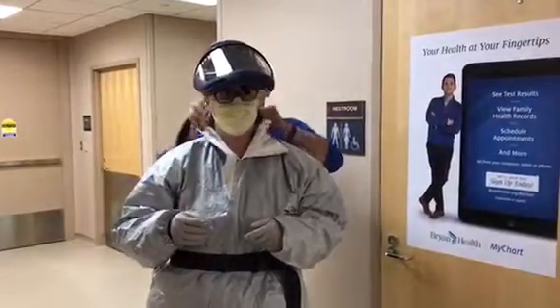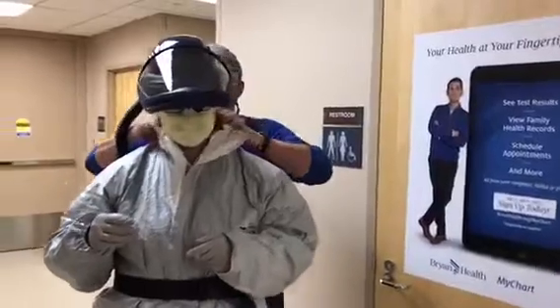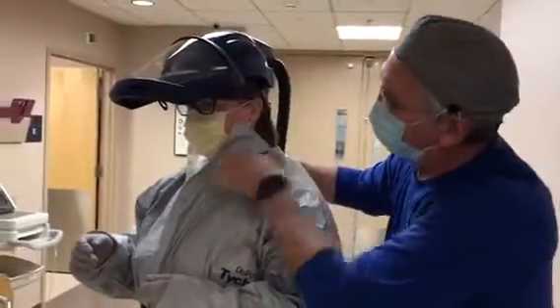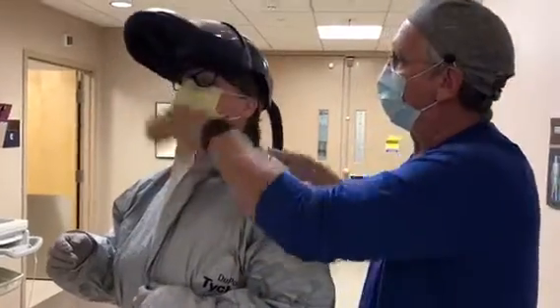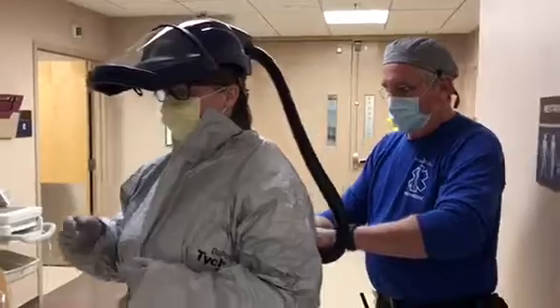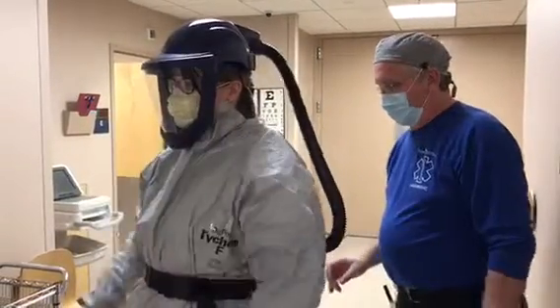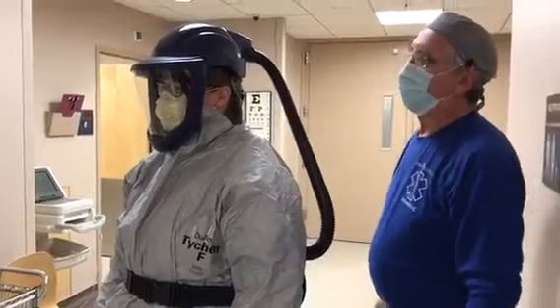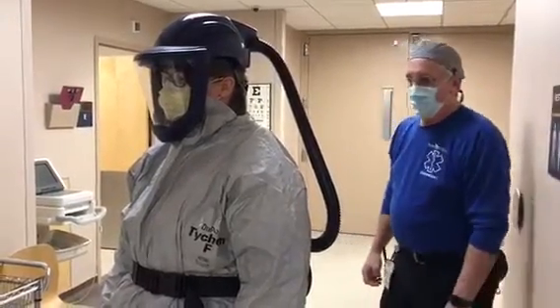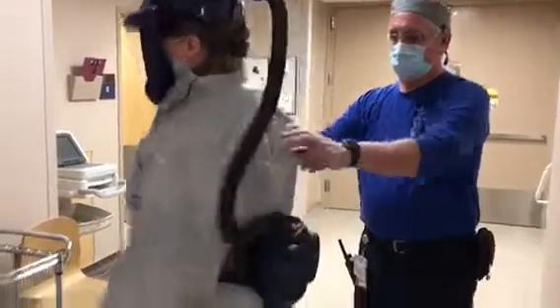It is important to wear a mask underneath so that when you take off the PAPR, you still have some sort of respiratory protection. For the reusable PAPRs, it is okay to wear a surgical mask, like this one. For the disposable PAPR hoods, those ones need to have an N95 underneath of them. You will then turn on your PAPR and make sure that it is working appropriately.